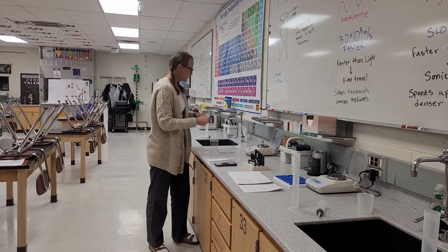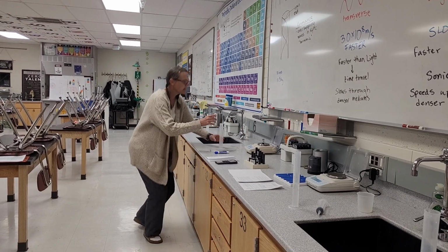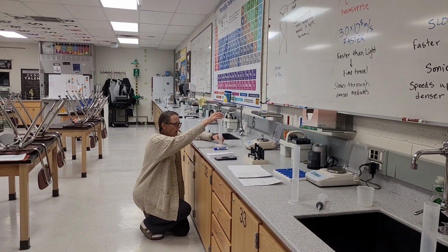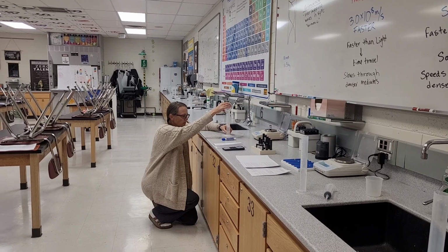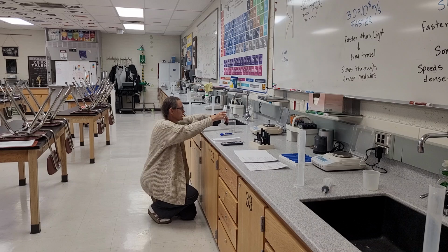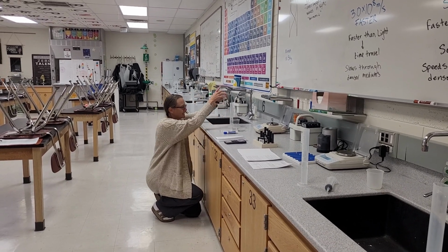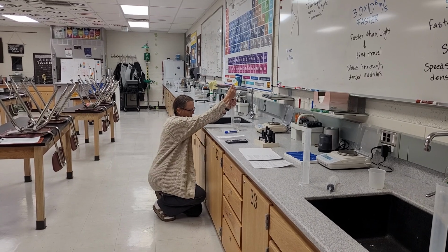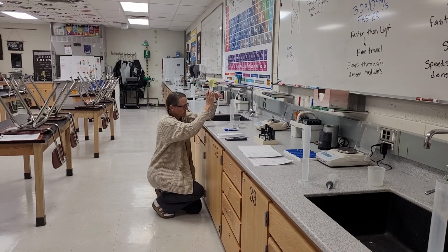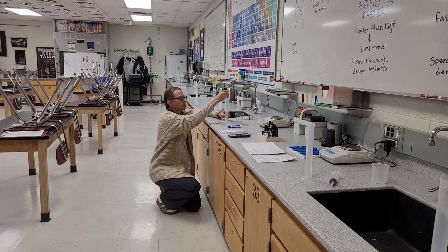And then once you have that, you're going to fill up your graduated cylinder. I recommend filling it up to 50, so you're minusing the same number each time. It just helps with the subtraction. And you want to get eye level. Sometimes it gets tricky, so you can use the pipette or the syringe to get it exactly. You're going to drop your object in.